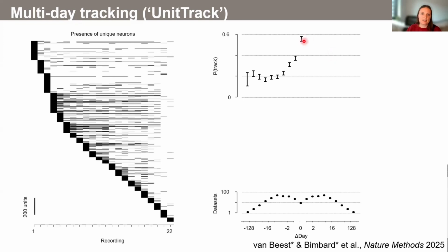If we now ask, okay, how many of these neurons did we find in the past? It's up to 20%, all the way up to 200 days. So that's actually quite impressive if you think about it. If you now ask, how many do I find in the future? It's going down a bit more towards 10%, which suggests that overall, the number of neurons we can record from over long periods of time may decrease, probably based on some buildup around the probe.